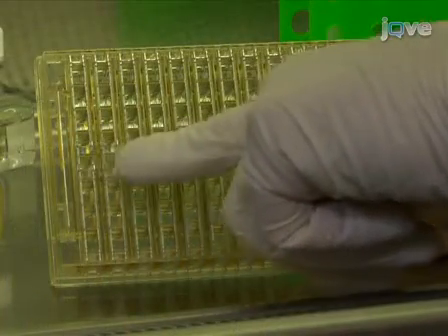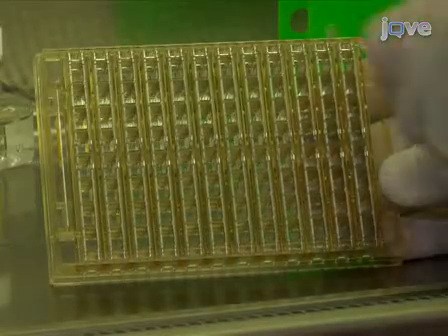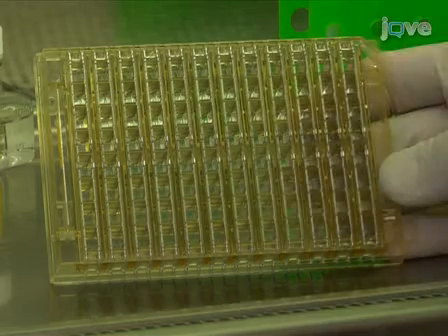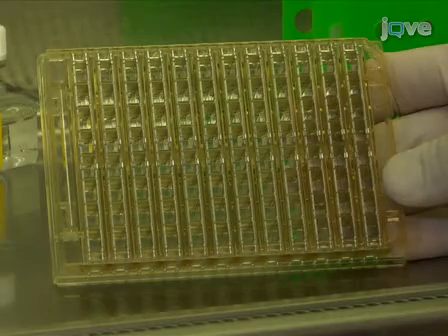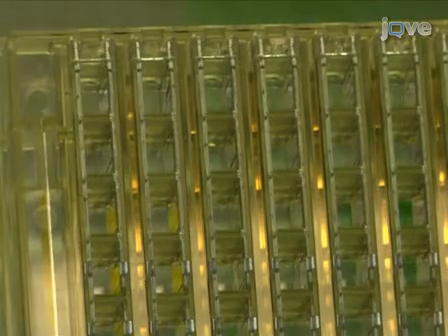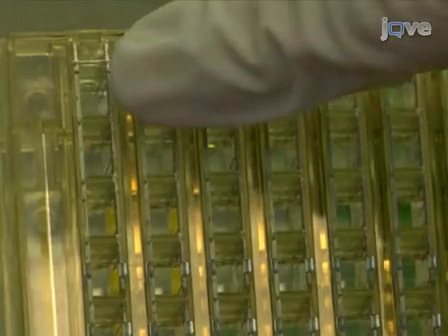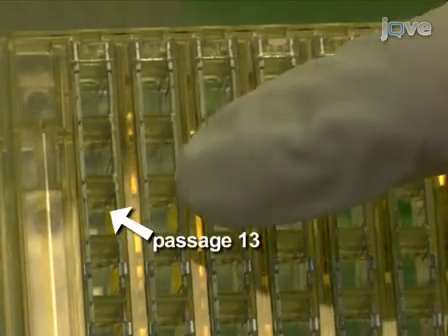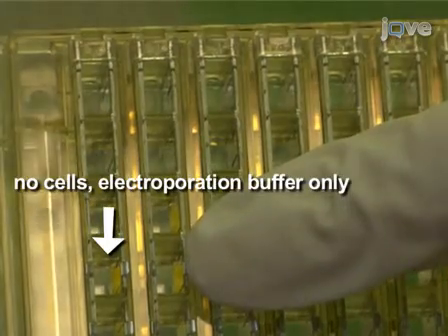The 96-well electroporation plate is also set up so that the top and bottom half of the plate is divided. So wells 1E, 1F, 1G, and 1H in the bottom of the plate all receive one pulse, but it is distinct from the pulse received by wells 1A, B, C, and D on the top. In this experiment, only half of the plate will be used. The first three wells of each well set contain cells of different ages: the cells in row A have been passaged 5 times, the cells in row B have been passaged 9 times, and the cells in row C have been passaged 13 times. Row D contains electroporation buffer only.